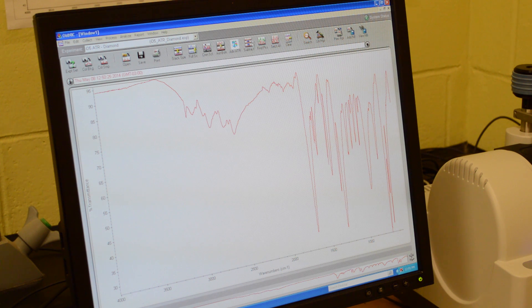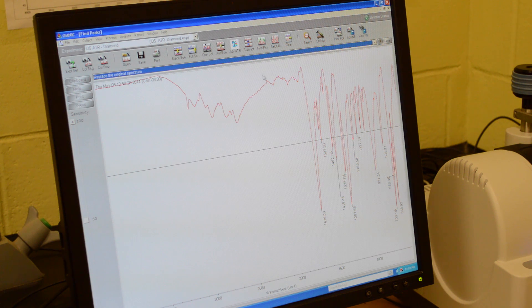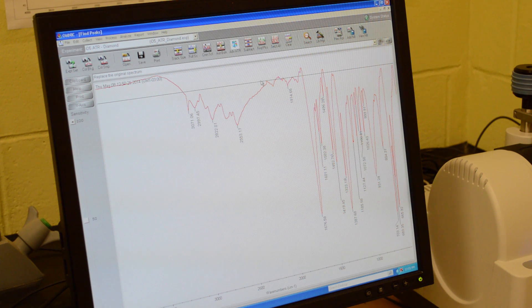Then you're going to want to find your peaks because you want to know what functional groups are present. Press the find peaks button. You're going to want to make sure that you get all of the peaks, so you can adjust the line by clicking above all the peaks.